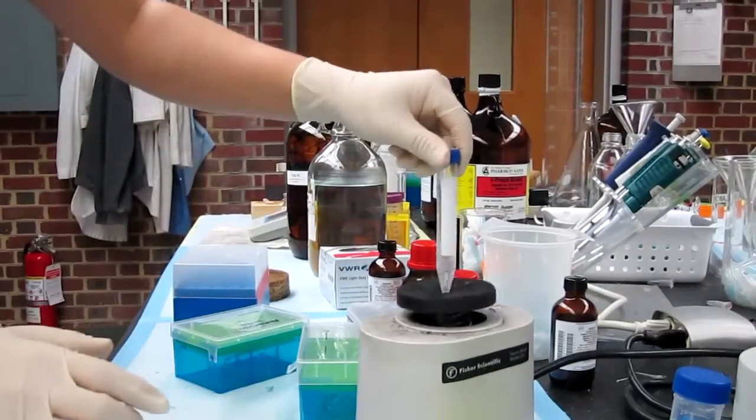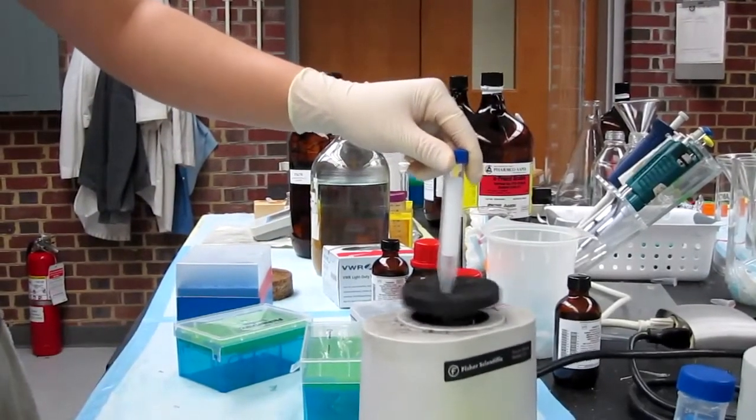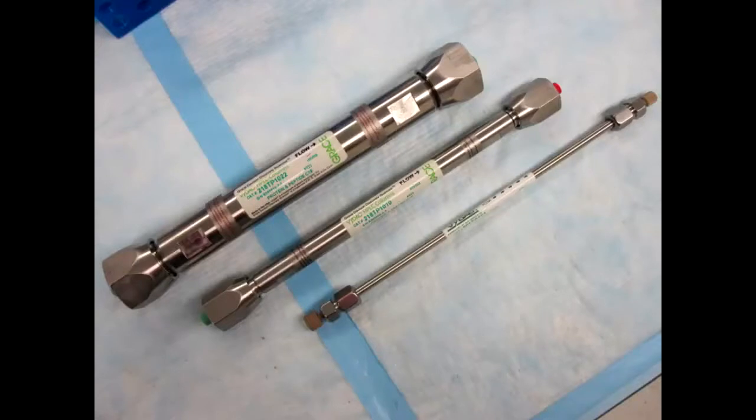Create the sample that you want to run. The concentration and amount of your sample depends on what column you are using. We usually add near the minimum amount that the column can handle because it gives better resolution in the chromatogram.